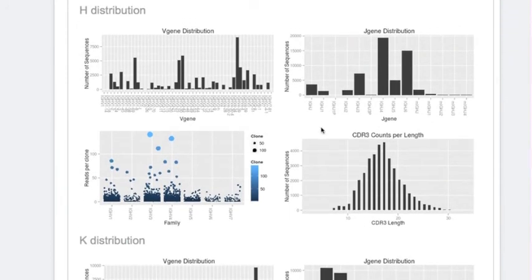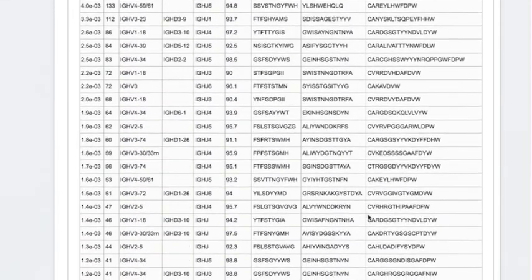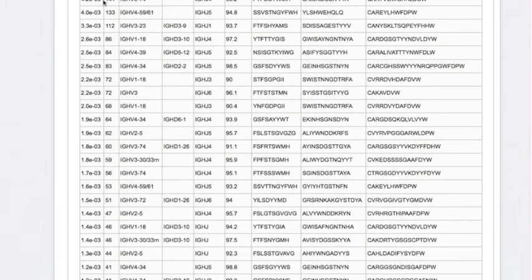In a healthy twin, I can see a broad variety of clonal expansions happening in their immune compartment, a wide distribution of V segments that I can export and then compare across samples, and a nice distribution of CDRH3s and J segments.